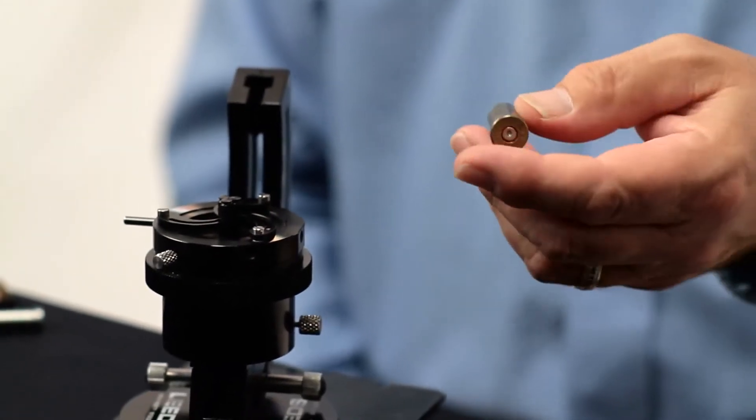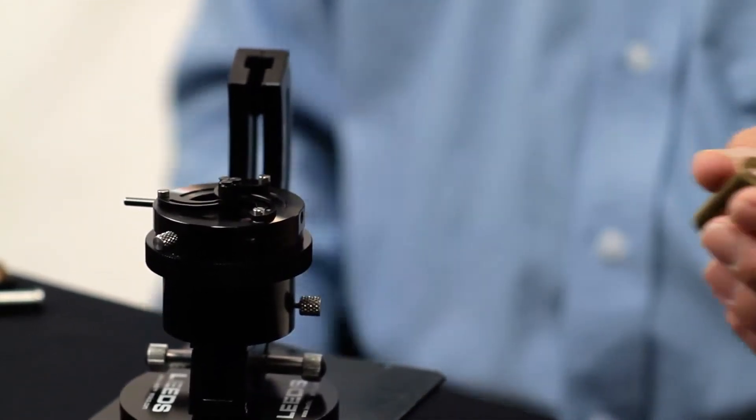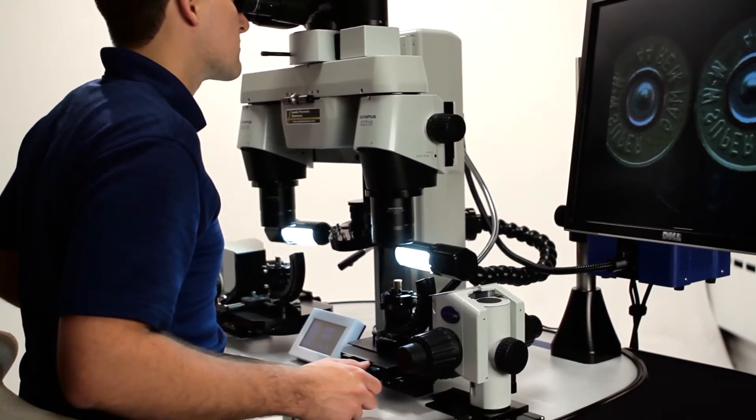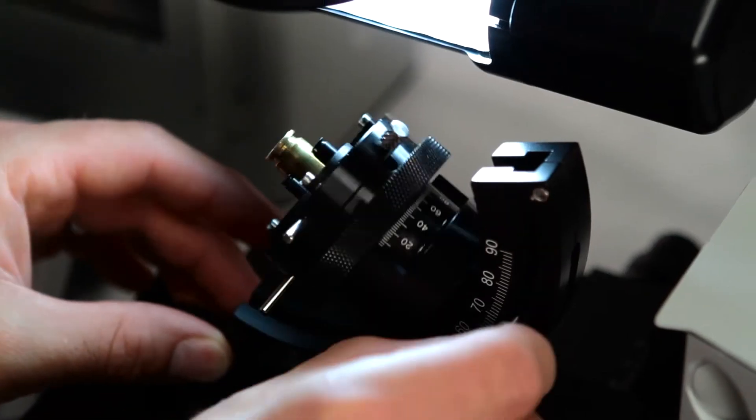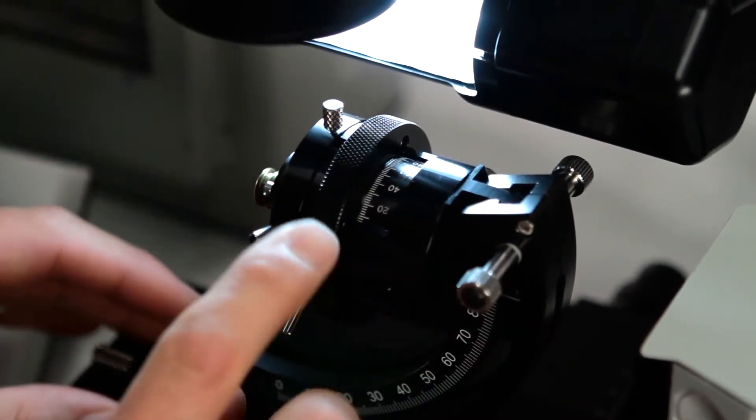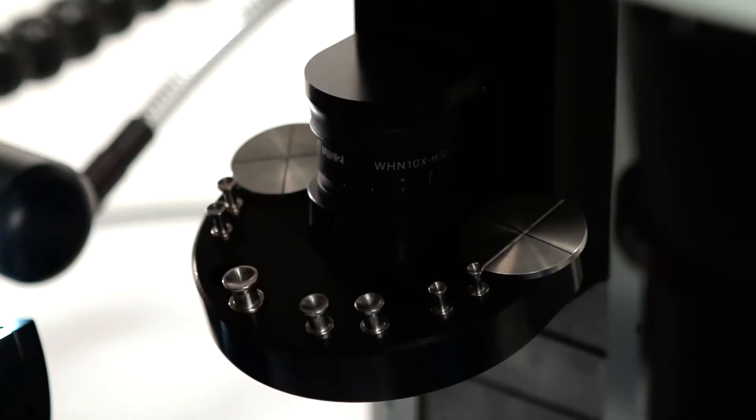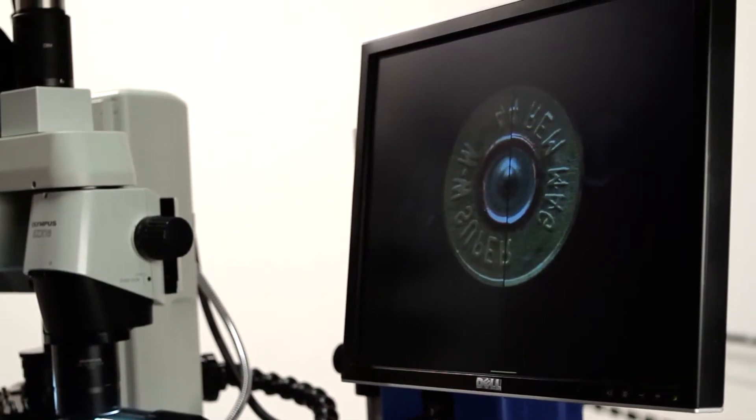The problem with those is that number one you need a whole series of different holders to be able to hold the different caliber cartridge cases that we see. So if you've happened to misplace just the one you need for your 9 millimeter cartridge case, you spend a fair amount of time looking for it.